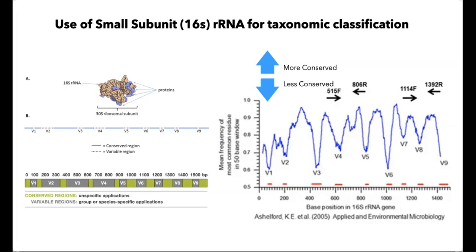This is a very useful length, because commonly used sequencers like the MiSeq produce approximately 300 to 350 base pair reads. So the comparison between the reads we generate and the target sequences is extremely straightforward and more reliable. This is one of the popular approaches to quantify the amount of different types of microbes present in our sample.